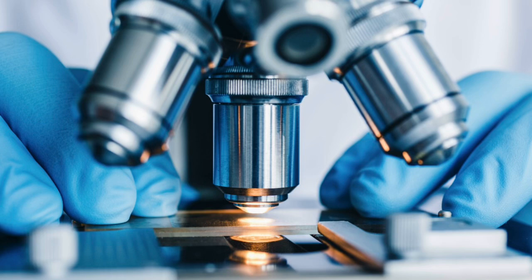Microscopy is the use of microscopes to examine evidence that is so small that it can't even be seen with the naked eye. In forensic science, it allows investigators to reveal hidden details, compare material, and make connections between suspects, victims, and crime scenes. In this episode, I'm going to break down how forensic microscopes work, explaining the major types used in crime laboratories, and how microscopy helps investigators transform tiny, overlooked evidence into meaningful forensic conclusions.